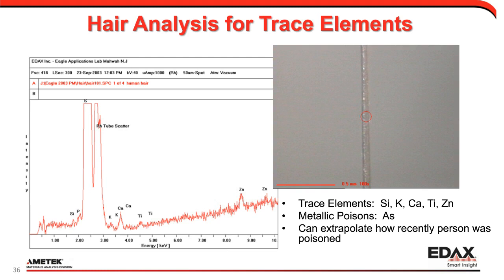I'm going to guess some of these elements are associated with the types of shampoo or conditioner that are used. Hair in general is comprised of a protein keratin, which contains a lot of sulfur. So that's why in the spectrum on the left here, you'll see that the sulfur peak is off scale at around 2.5 kV.